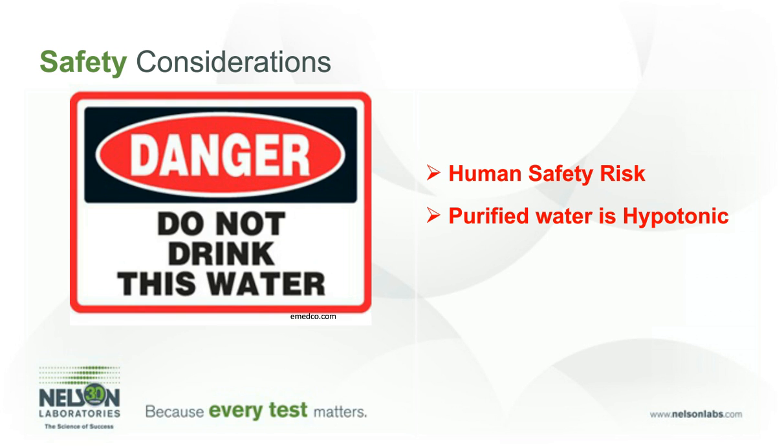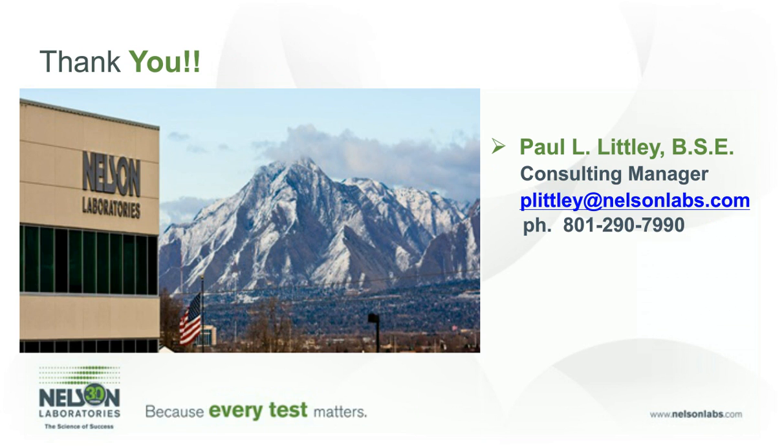This brings us to a close of today's water quality presentation. In summary, the goal of effective water treatment in the MedTech industry is to prolong the life of medical instrumentation, ensure effective device functionality, and to minimize the risk of adverse patient outcome arising from contamination. Management of a quality water system is paramount to every healthcare facility and/or manufacturing environment. It is the responsibility of the manufacturer to ensure the proper water quality is selected and maintained for the intended use as a raw material in the manufacturing process.